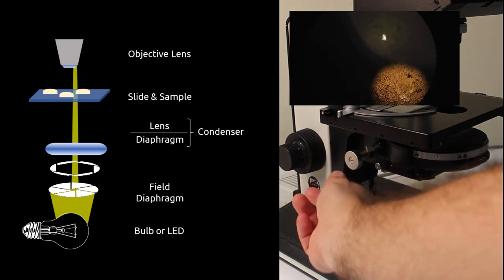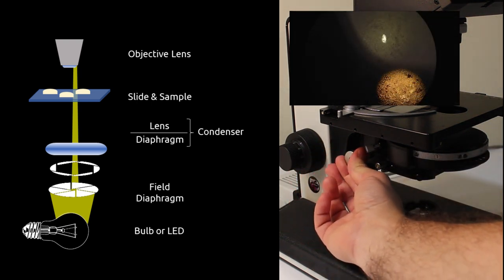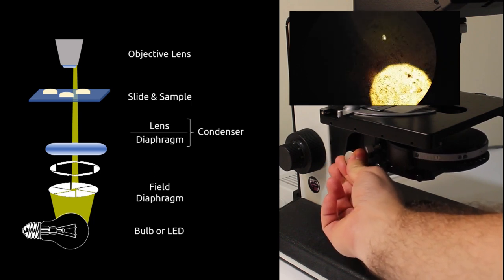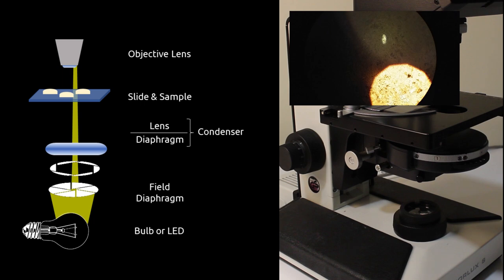To focus, turn the knob attached to the condenser until the bright point in the image is a sharp-edged hexagon. You don't have to close this down the full way to do this. You just need it closed down enough to be able to see the edge of that hexagon. What we've done here is we've focused on the field diaphragm, which makes sure that we're not focused on our light source.